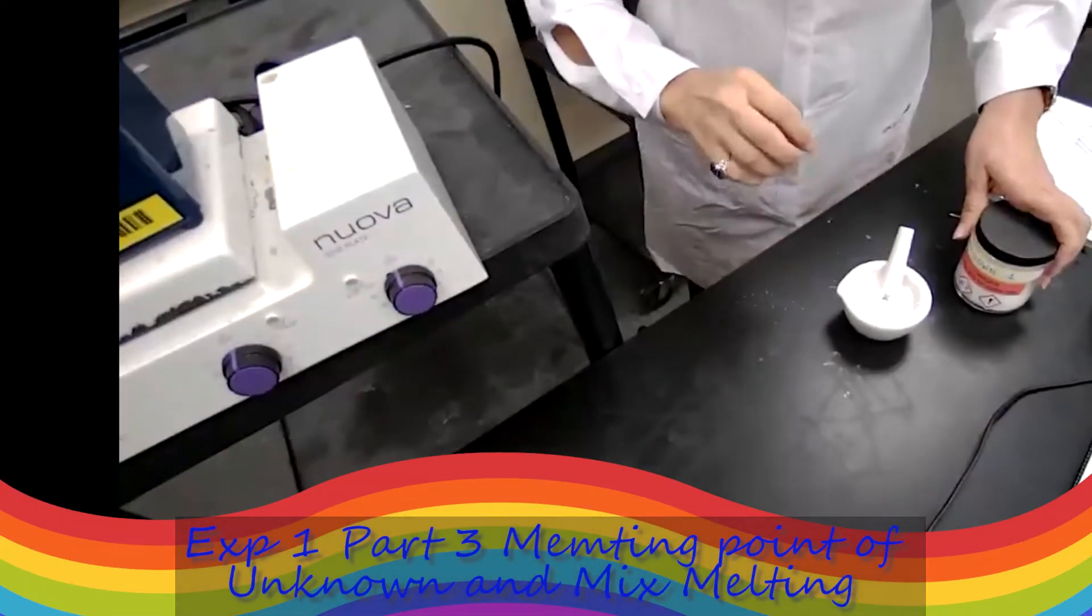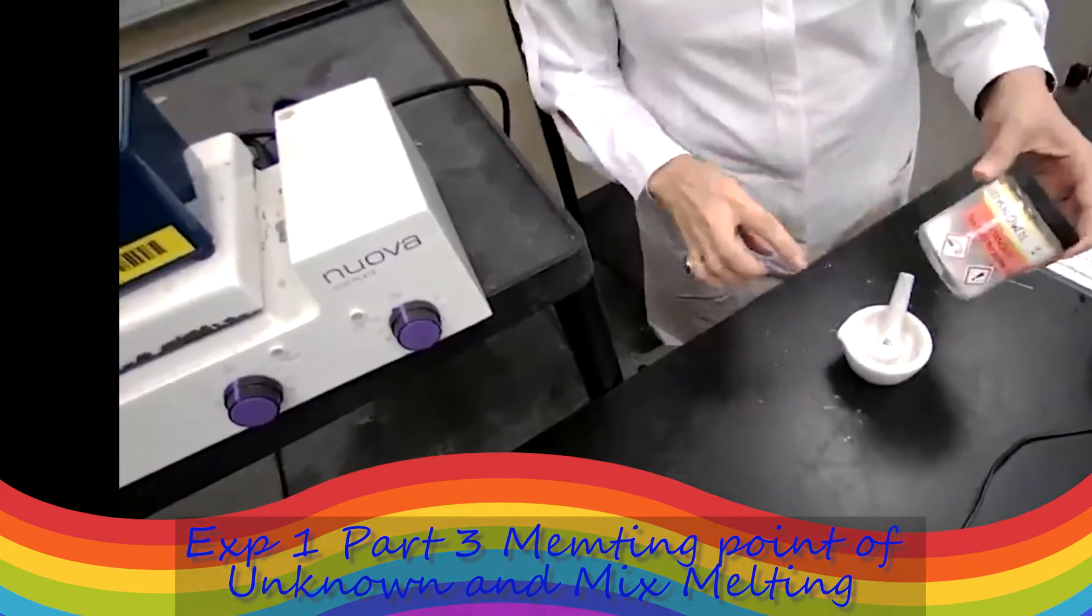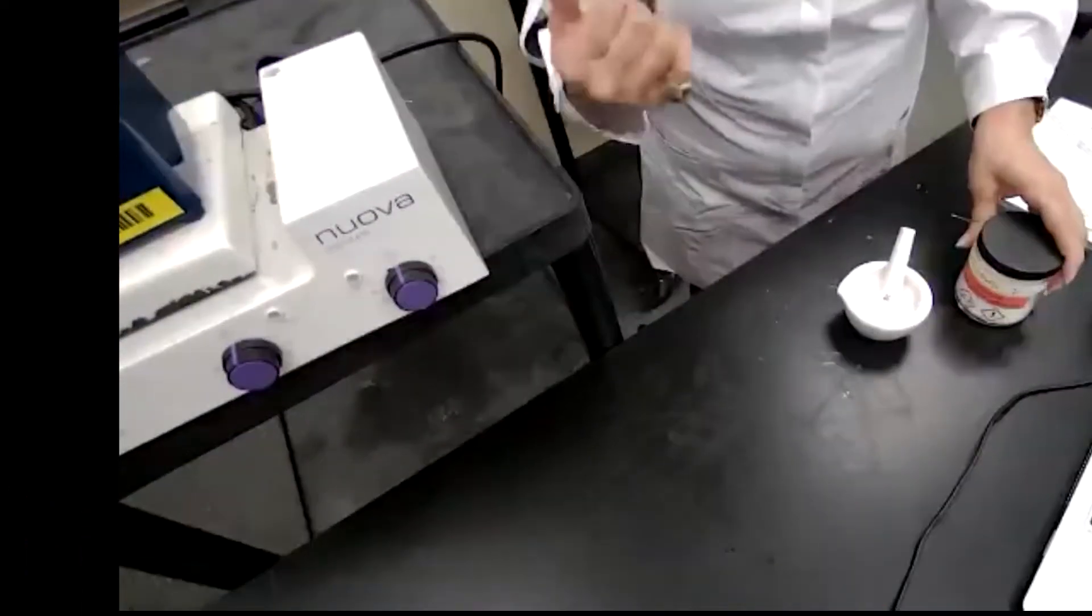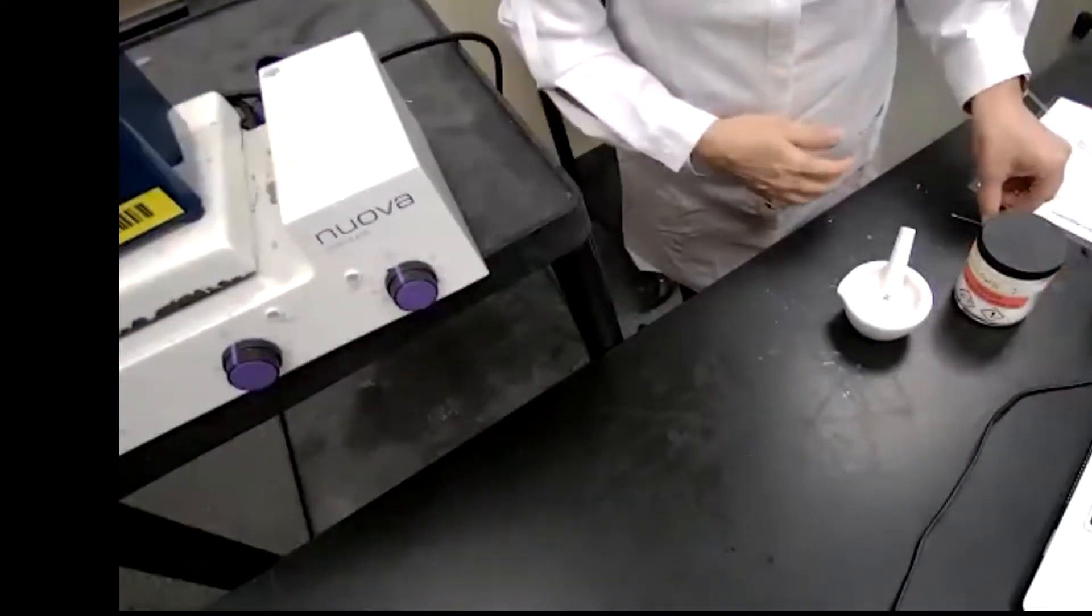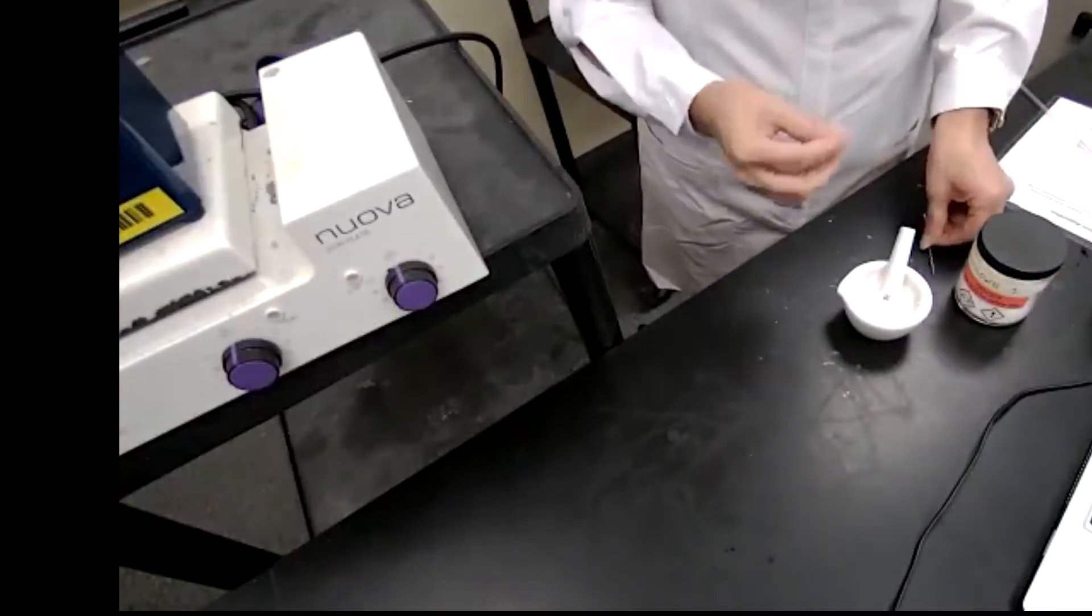For the next part of the experiment, we are going to measure the melting point for unknown. For the unknown, I don't know what should be the setting on the meltdown apparatus. So for that reason, I'm going to prepare two samples.